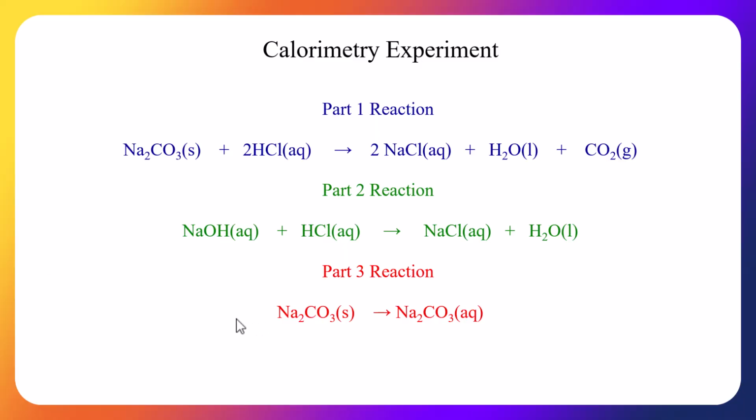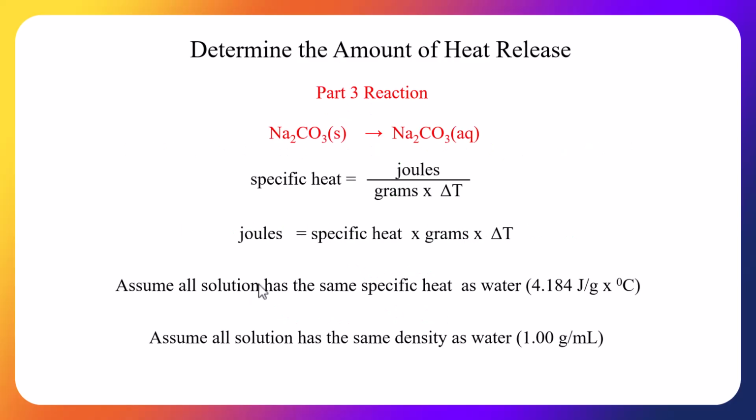So part 3 is we're going to be taking solid sodium carbonate and we're going to be putting in water, and it's going to go into solution. So we're going to get the amount of energy released from that reaction. Alright, same thing, specific heat's the same, joules is the same, assumptions.